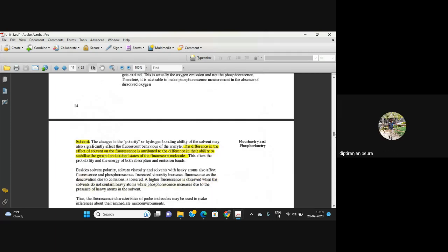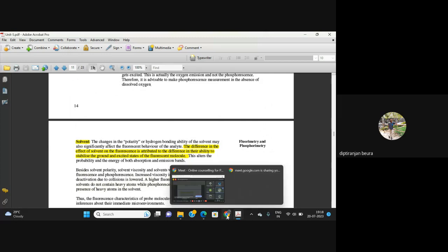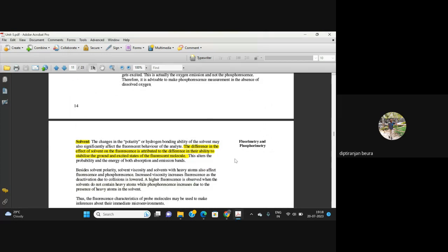You want a good signal to noise ratio and a good intense signal. However, your IR radiation is not that intense or powerful, not that strong energy-wise. So you are giving all wavelengths into the sample; you are not making it monochromatic, not putting a single wavelength radiation to the sample. You put all wavelengths so that the sample can absorb the radiation and go up. Then, while studying the emitted part, we put the monochromator so that we can collect a signal, whatever radiation we want to study.